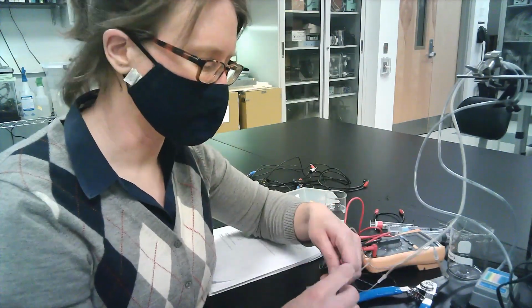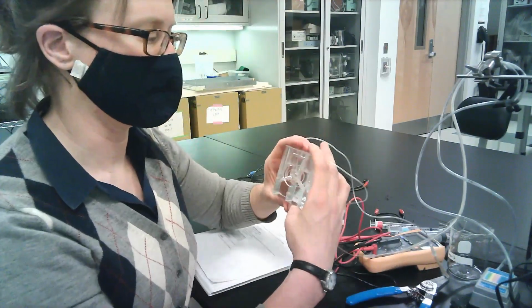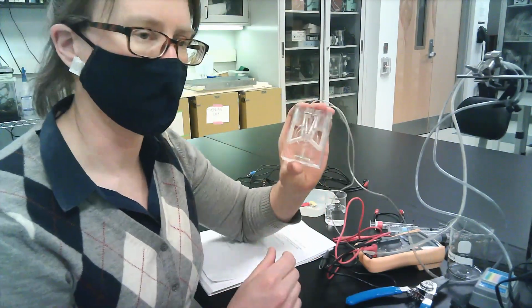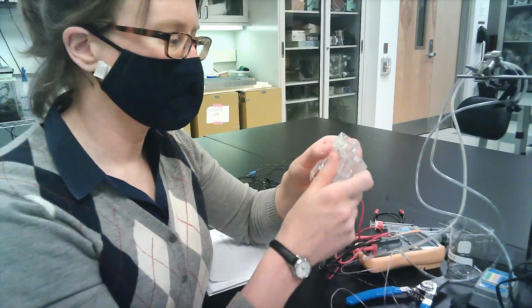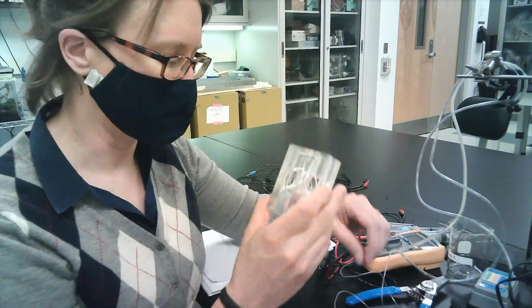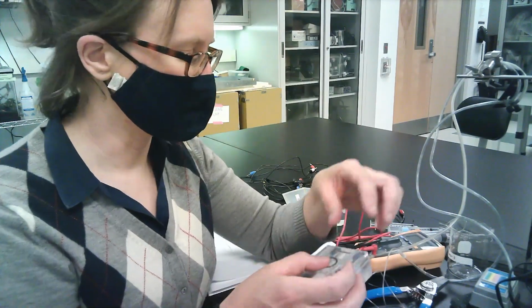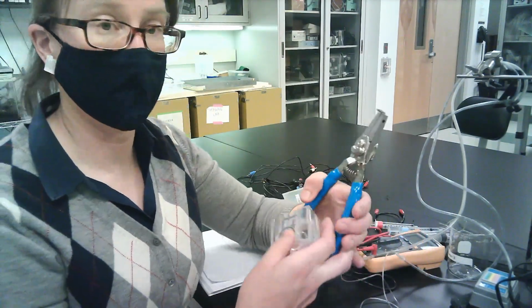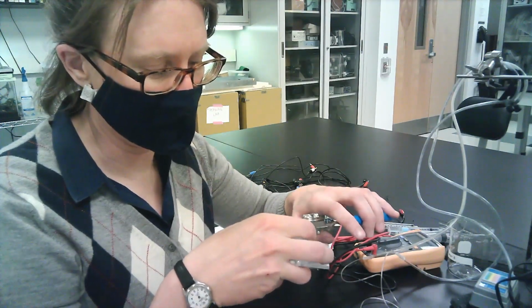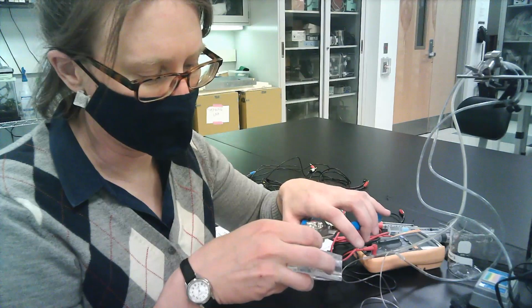You might also find it helpful to tape these tubes in place just so they don't wind up walking around. And in fact, you might find it easiest to just tape the whole chamber in place once it's ready. After you put it back together, just again to make sure that the connection between the two halves is very good, there's a set of these rings, clamp rings, and there's one set of spreader pliers which can be used to secure the clamp rings in place, just to ensure a very good seal for your chamber.